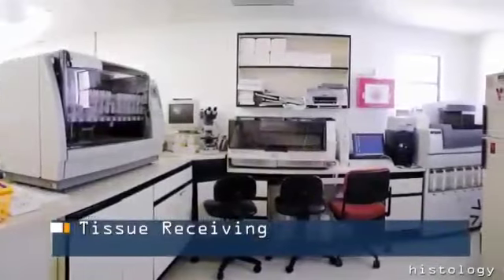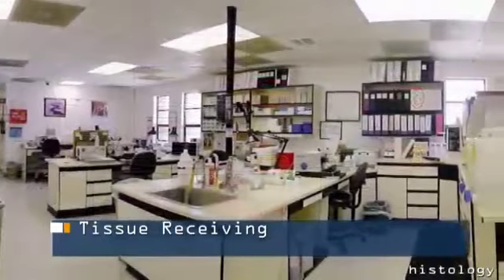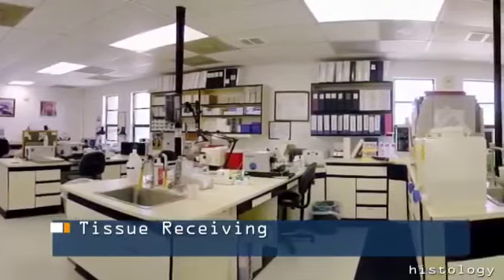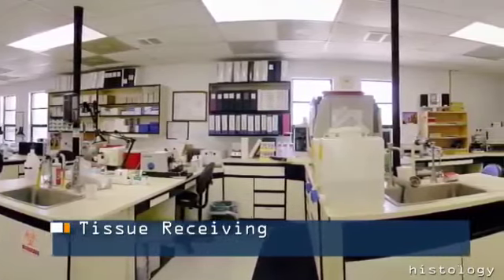Tissue receiving. Tissue specimens received in the surgical pathology laboratory contain specimen details and patient information. The samples are received fresh or in liquid preservatives such as formalin.